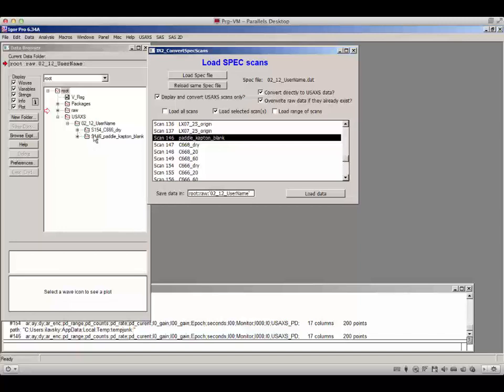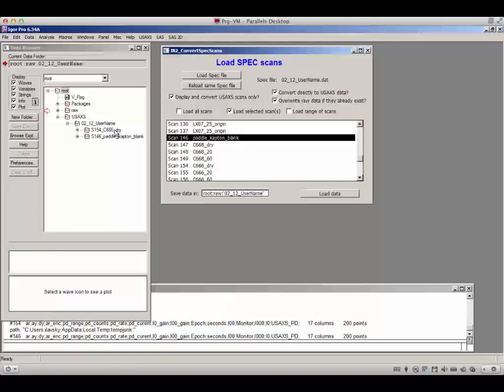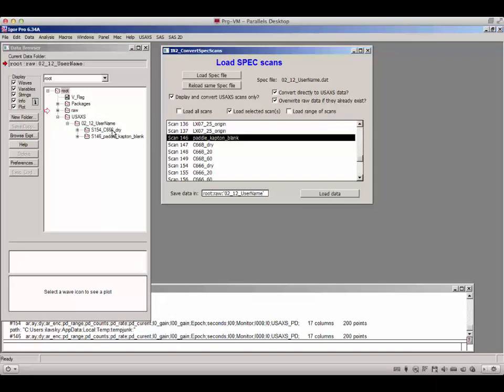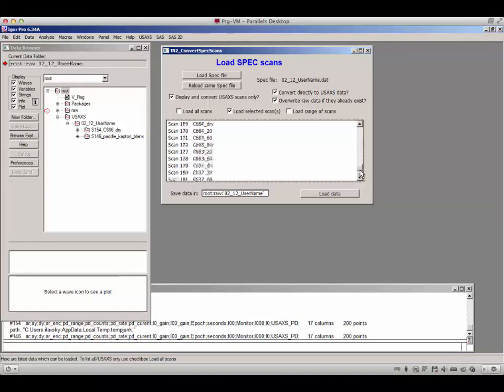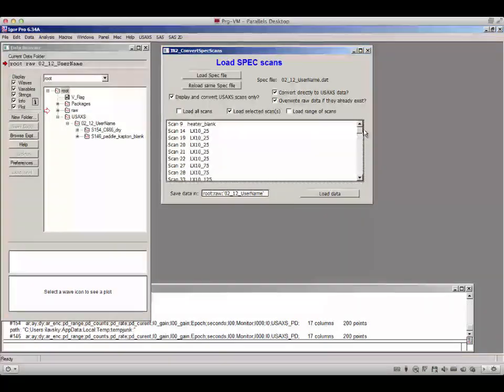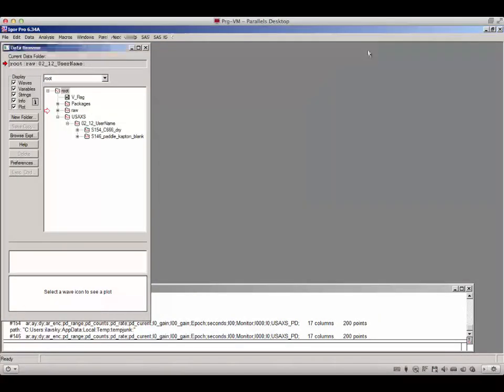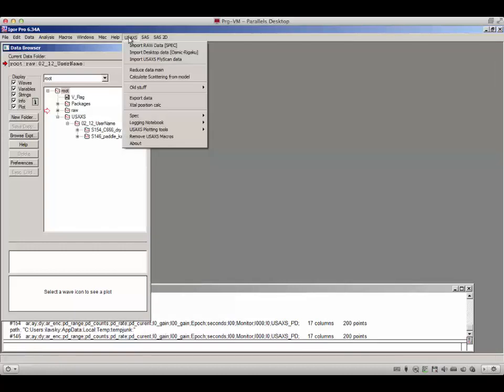The data are automatically created. In the Igor data browser, you will see a USAXS data folder, inside that a folder named after the spec file, and inside that a folder containing all data related to your sample. This should be all you need from the spec file for one sample. Most likely you would load all or a range of scans, as one spec file can contain a very large number of scans. If you collected USAXS data via fly scan, you can also import those using the fly scan import option.